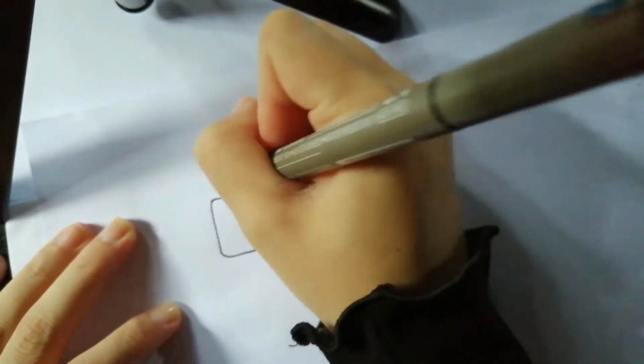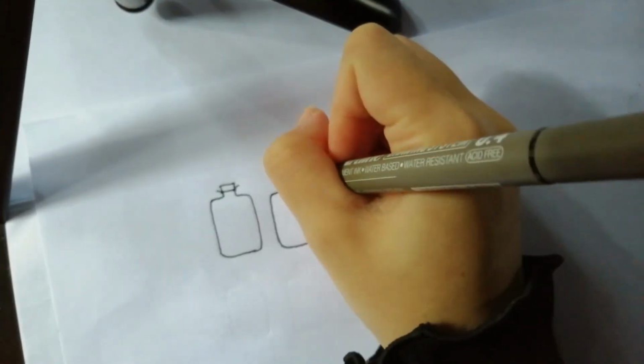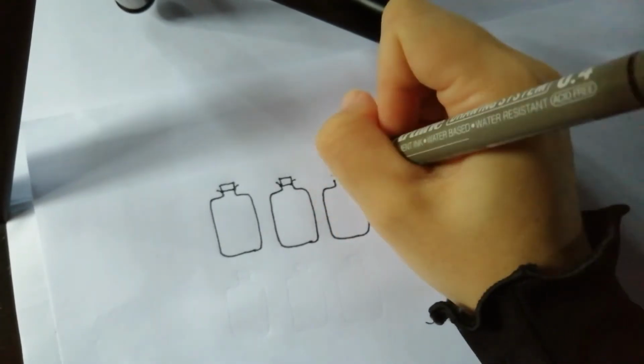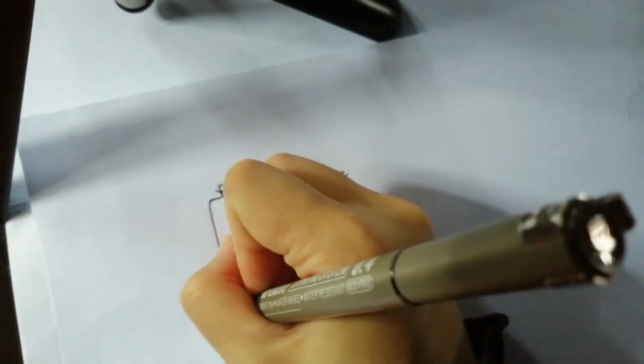Prepare 2 sets of BOD bottles, 3 bottles each set, filled with dilution water saturated with air for the blank.